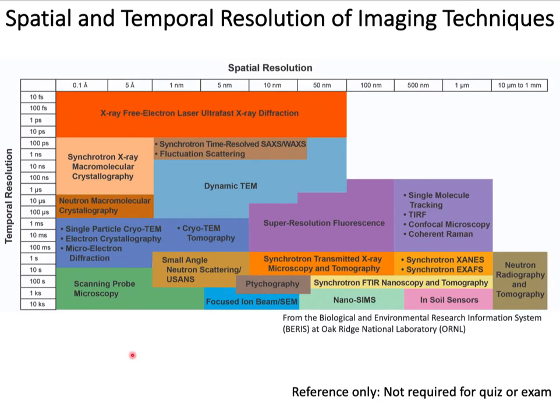So let's take a look at the spatial resolution of electron microscope. The focused ion beam of the SEM, or scanning electron microscope, is in the range of 2 to 10 nanometers. This range is great for visualizing relatively larger surface structures. The dynamic TEM, or transmission electron microscopy, can visualize at twofold higher resolution than SEM, up to about 1 nanometer range, and can visualize ultra-thin section samples as well.